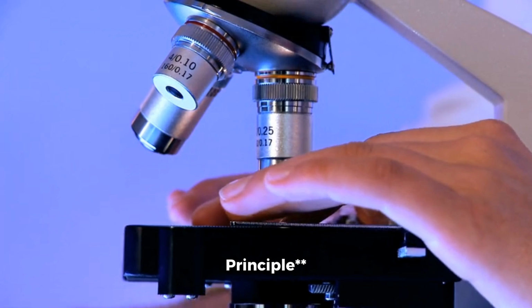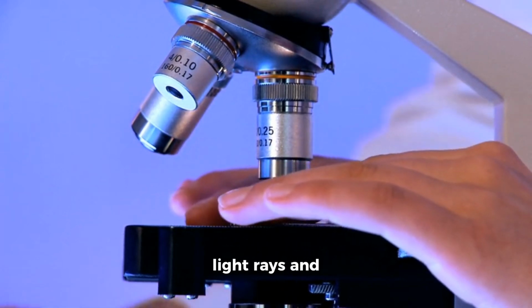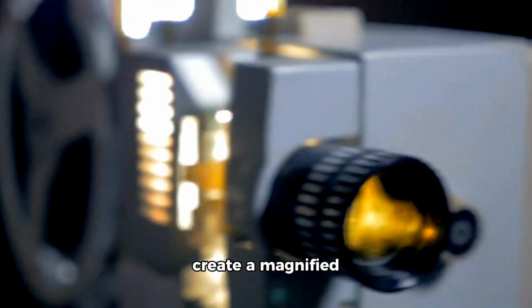Basic principle. Microscopes use lenses to bend light rays and create a magnified image of a small object. This principle relies on the behavior of light and optics.